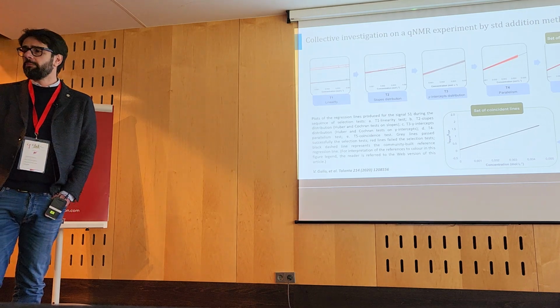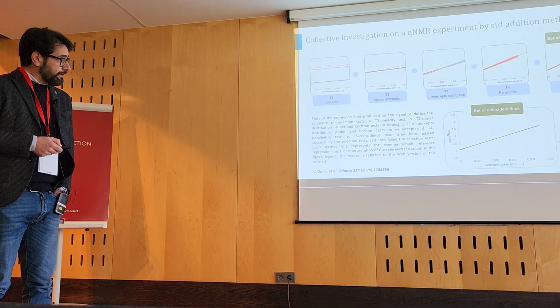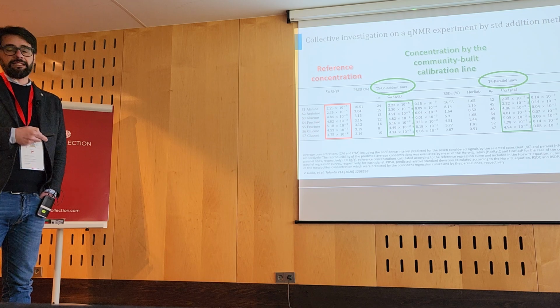So a community-built calibration line, we say. And we applied these lines to quantify some metabolites using 7 different signals.